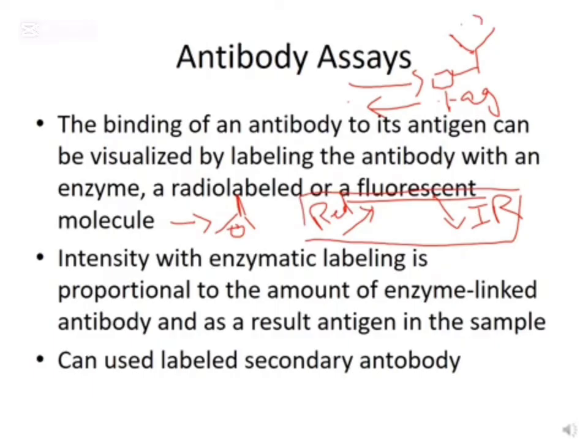If it does, that means that the antibody is bound to the antigen. If it doesn't, then that means that the antibody does not bind to the antigen, meaning that the antigen is not present if we're looking for a certain antigen.